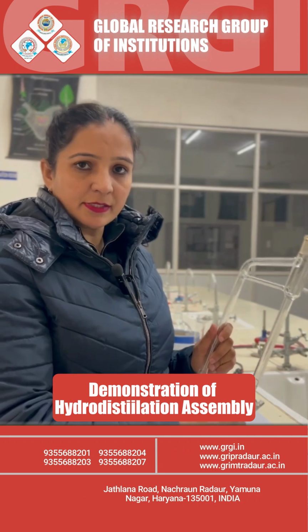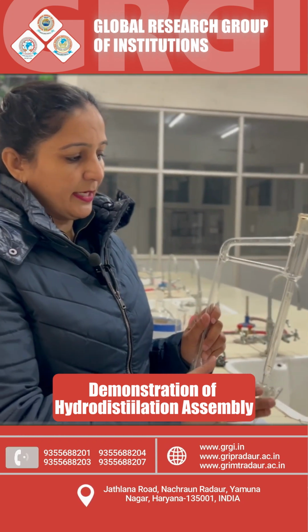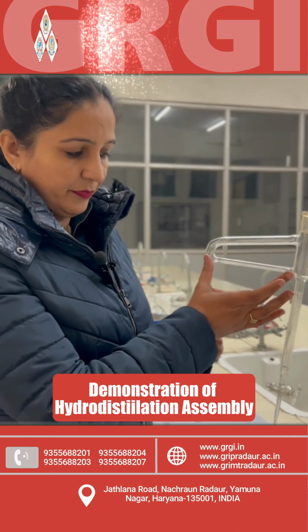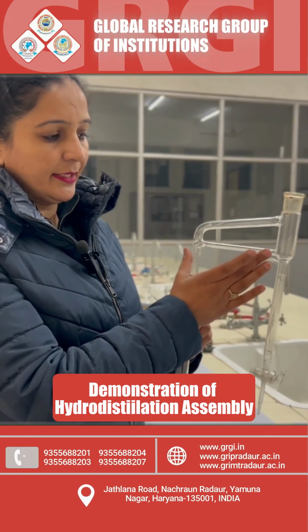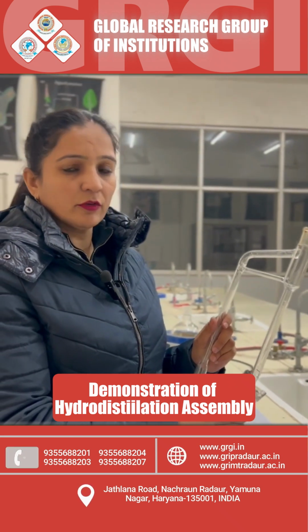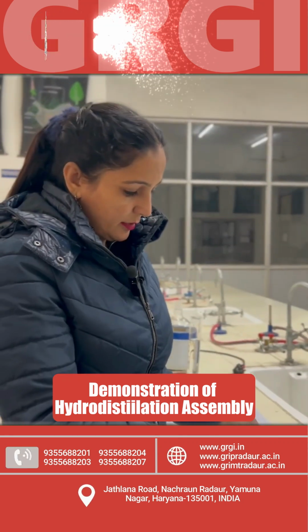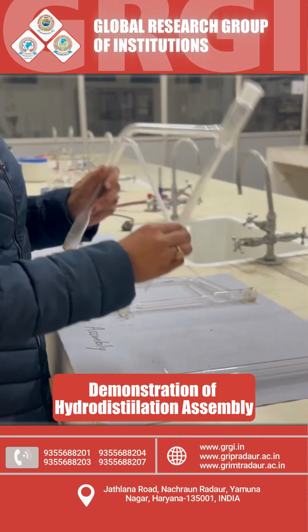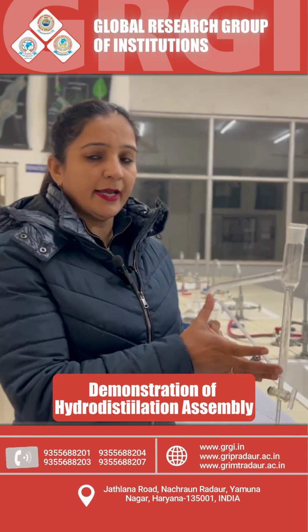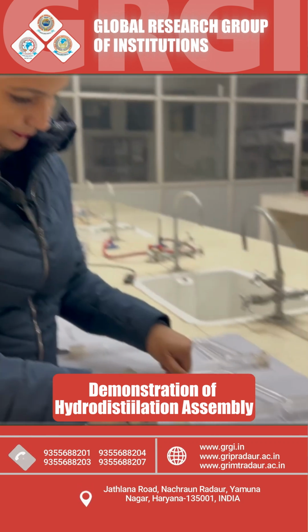Almost 99% of volatile oils are lighter than water, but in some cases like clove oil, it is heavier than water as it has a specific gravity of 1.042 and that of water is 1. So in that case we can use this assembly. Otherwise, in case of other crude drugs, we can isolate the volatile oil by using this N type of assembly.